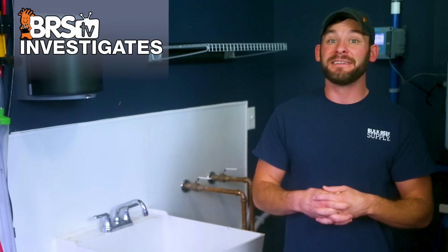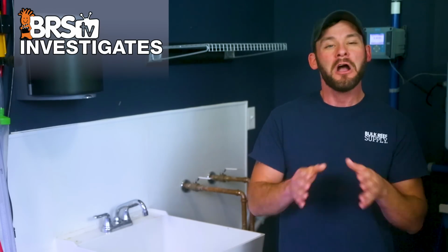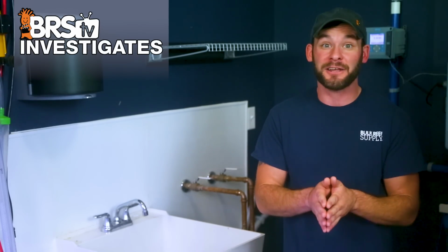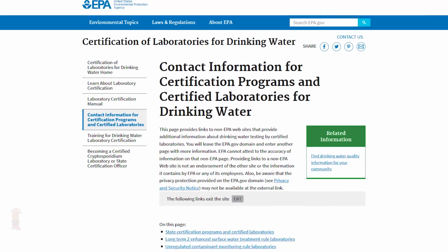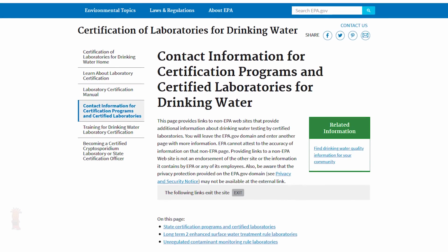I don't doubt that the aquarium industry ICP test kits that cost us around $30 or more are a far cry from the accuracy and cost that goes into governmental drinking water testing, so we should have some reasonable expectations for the results.